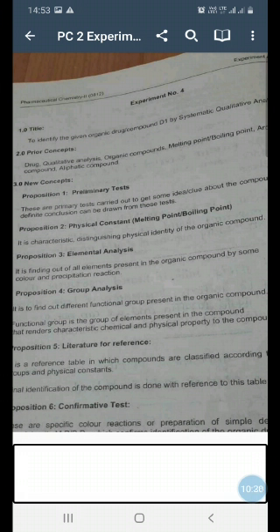There is a table of all the organic compounds according to their class, and the physical constant of every compound is mentioned. Say for example, I have got a result that my compound is a member of the carboxylic acid group. So I will open the table of carboxylic acids. Now in carboxylic acids I find that there are two tables, aromatic carboxylic acids and aliphatic carboxylic acids.